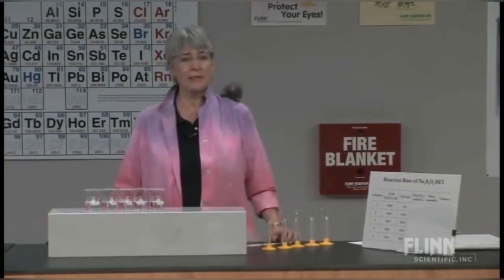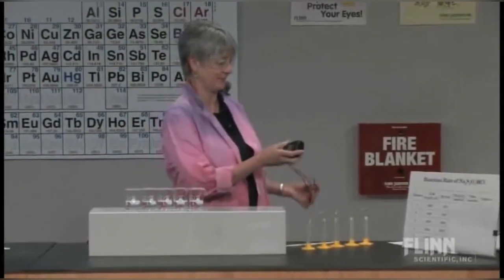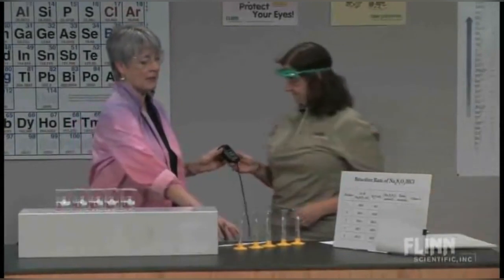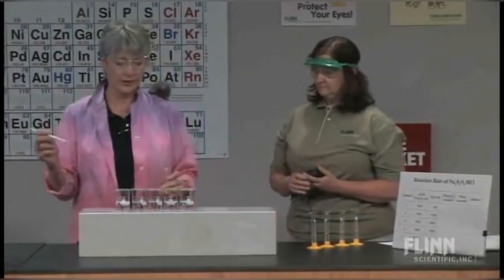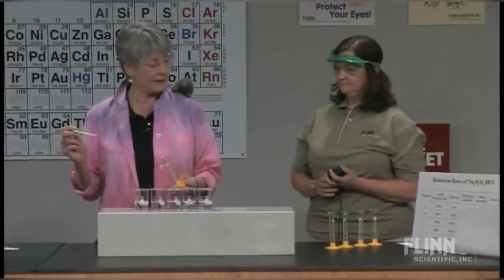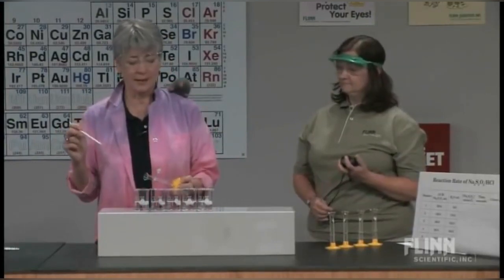So we need to time this, and can I get a volunteer? Janet, I'm going to tell you when to start and when to stop. And I'm going to put the hydrochloric acid in here, and then tell you to start and then stop.